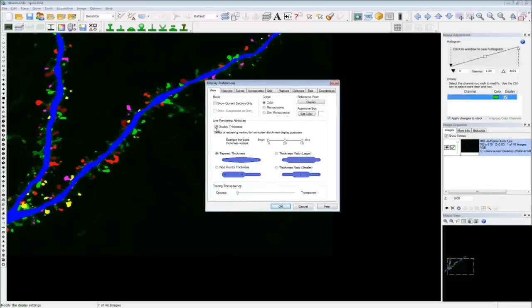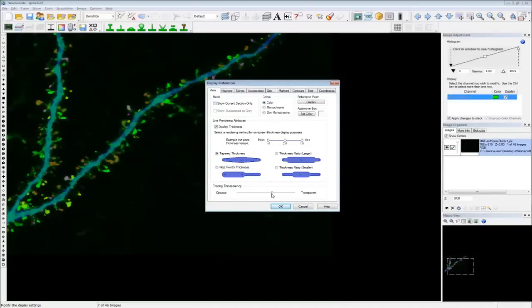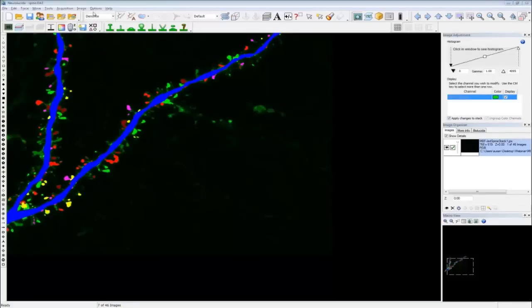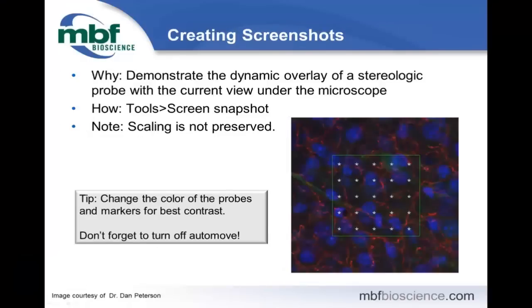This is more for Stereo Investigator users. I'm going to load an image and perform the Cavalieri probe on it — the volume estimation probe. I'll quickly mark in the hippocampus, and then to demonstrate where I did my marking and how I got the volume measurement, I can just make a screenshot: go to Tools > Screenshot. Looking in the image organizer, I have my screenshot available to save. Note that this won't save scaling — it's more of a visualization to display the probe and where you sampled.